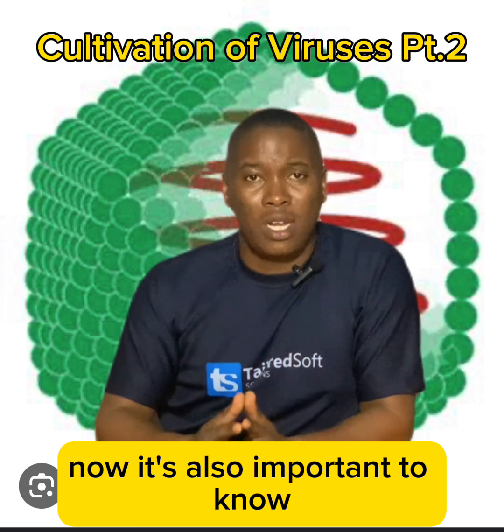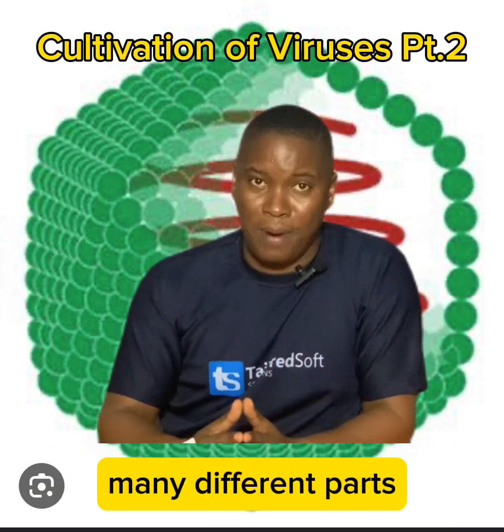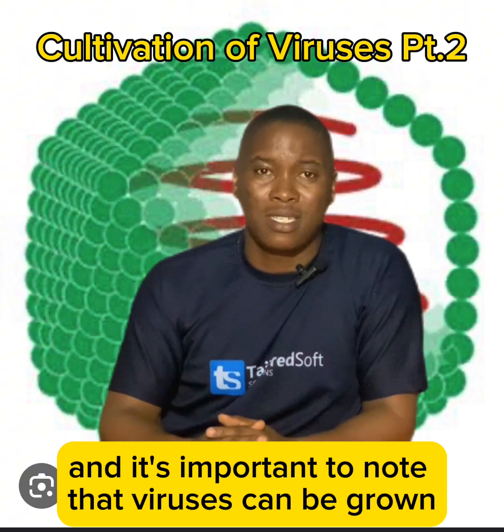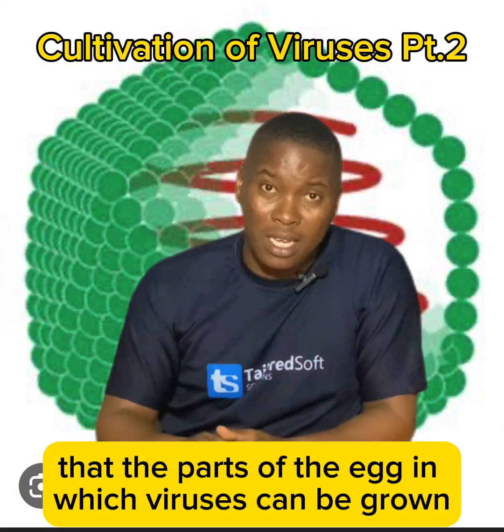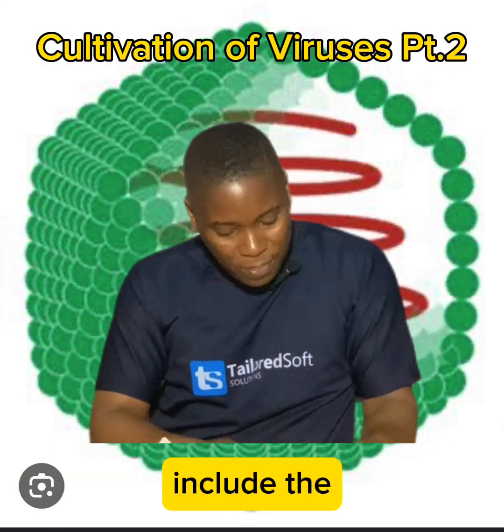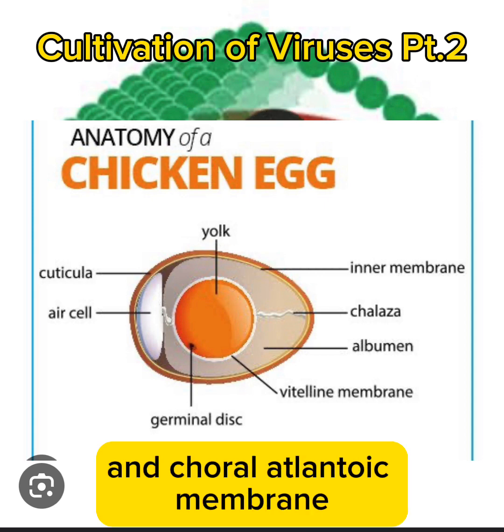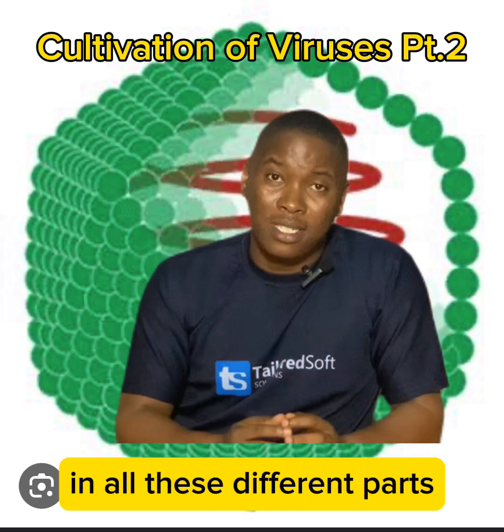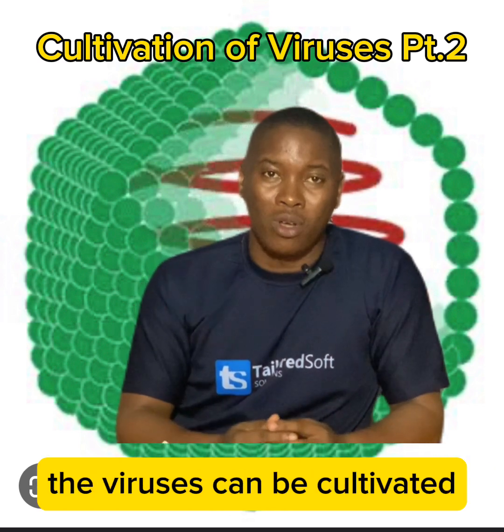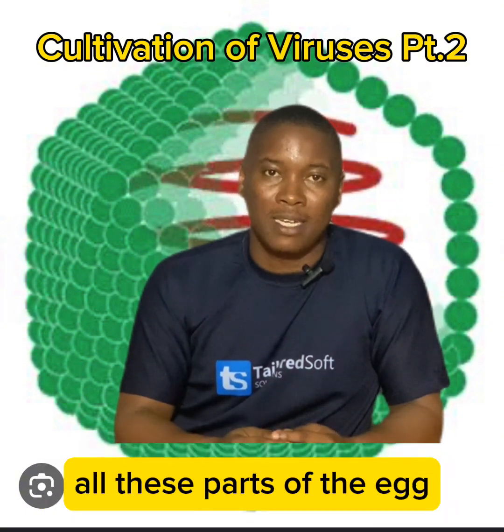Now, it's also important to know that the chick egg has many different parts, and viruses can be grown inside all of these different parts. The parts of the egg in which viruses can be grown include the allantoic cavity, the yolk sac, the amniotic sac, and the chorioallantoic membrane. All these are parts within the chick egg, and in all these different parts, viruses can be reproduced and replicated.